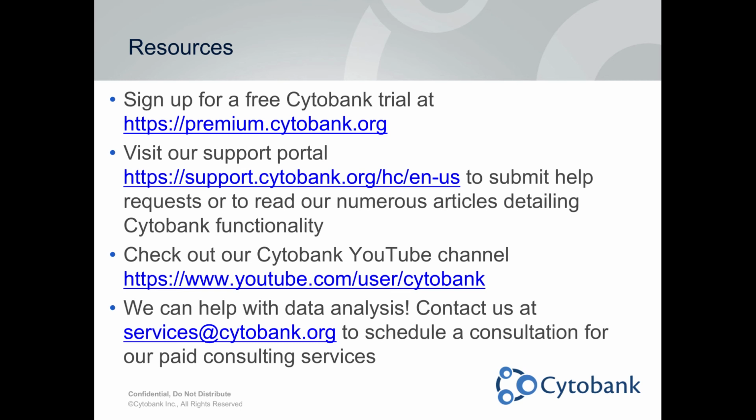Can you comment on how you decided which tools to use in your data analysis pipeline? Okay. It was a very difficult decision, very good question. When we started working on that, it was early days on Cytof, and not many tools were available. Correct me, Hannah, if I'm wrong, but I think even Spade wasn't available on Cytobank.